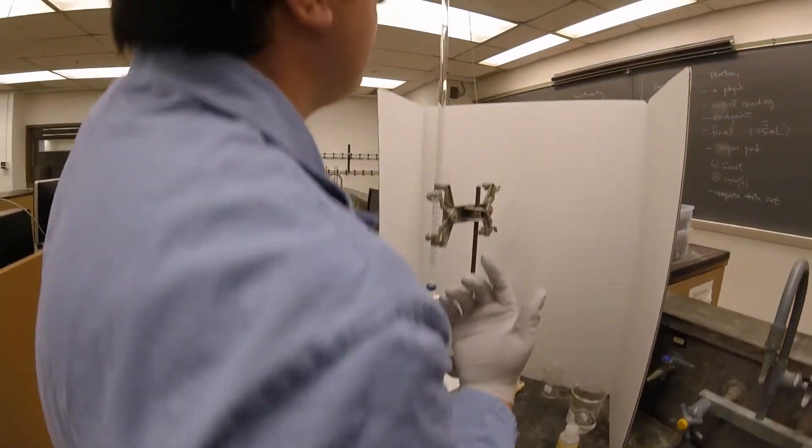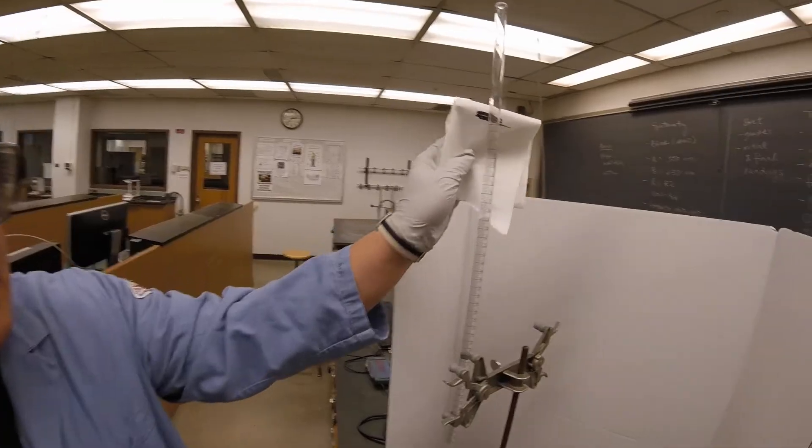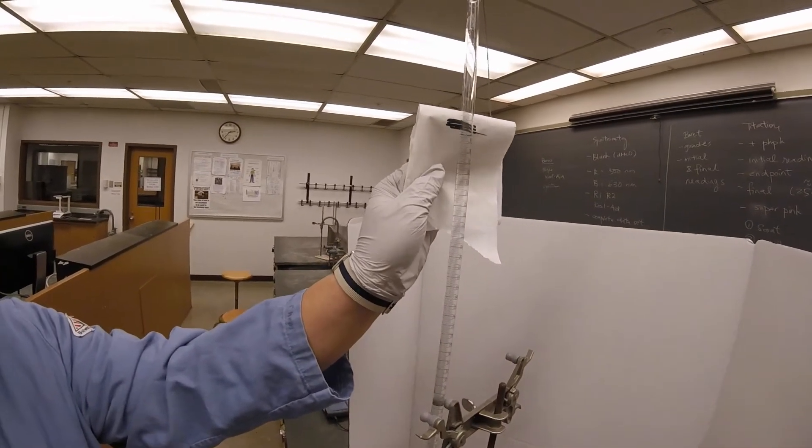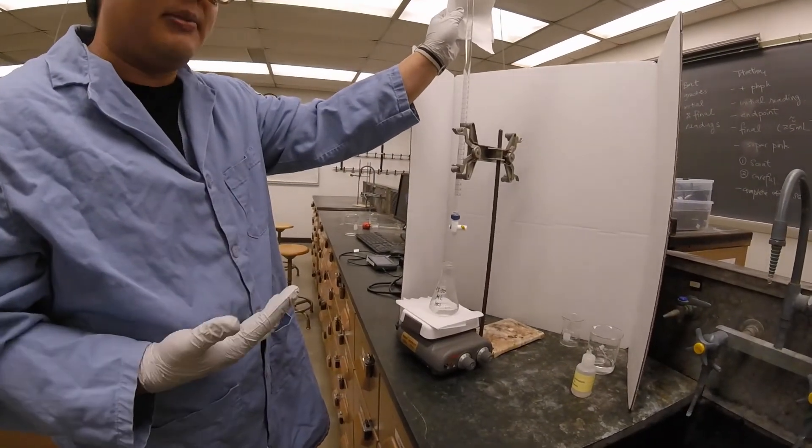Right now, the initial volume looks to be about eight milliliters. Again, I'm just using approximate numbers because this is the point of the scout titration — we're just trying to figure out how much volume we're approximately using.